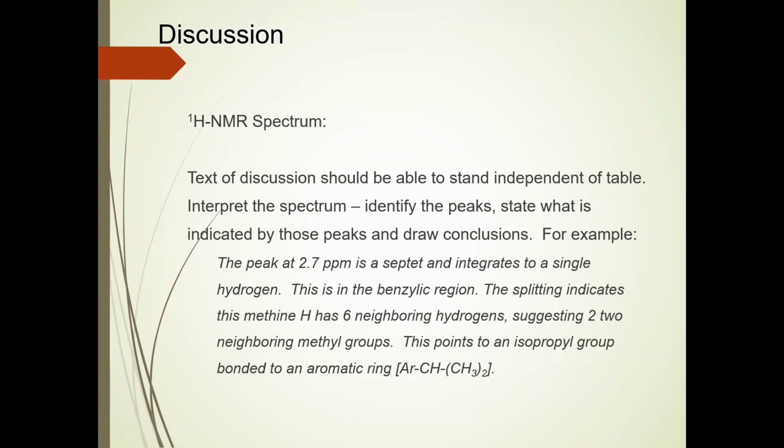But give that structure. Do make the assignments though. This peak correlates with hydrogen A or hydrogen B. But do that for each one. You'll have little paragraphs like this.